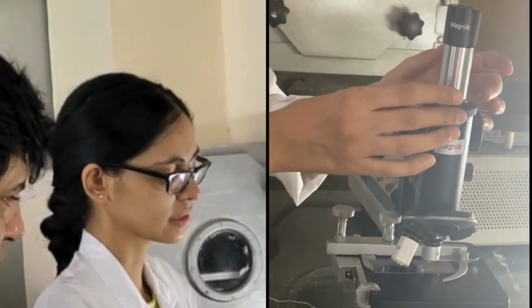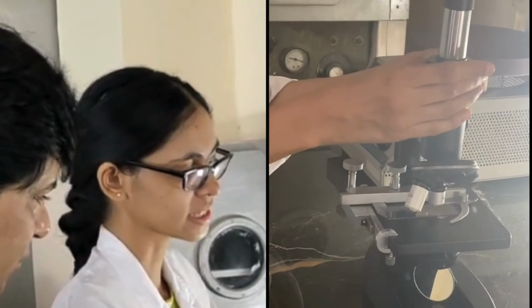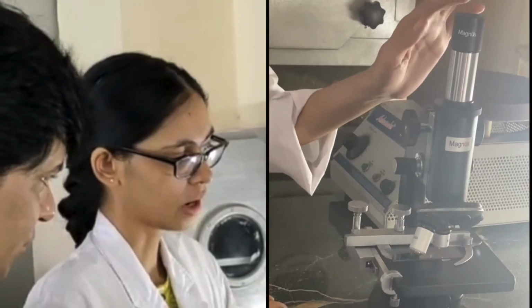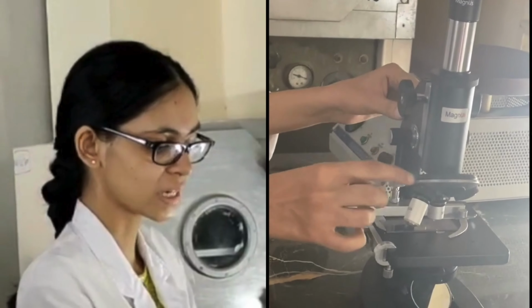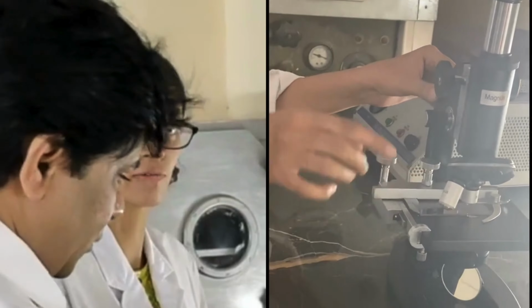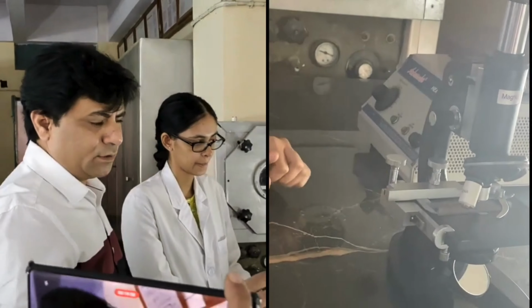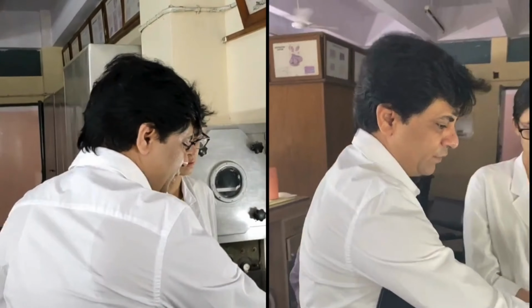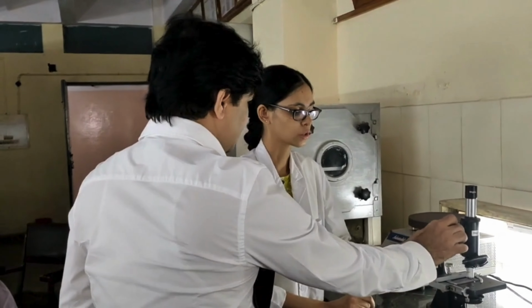So this is the arm of the microscope, where on this end we have the eyepiece, and these are the objective nose piece, which has various objective lenses of different magnifications: 5x, 10x, 40x. These are the different magnifications of these objective lenses, and here it's an eye lens. And this is the coarse adjustment.